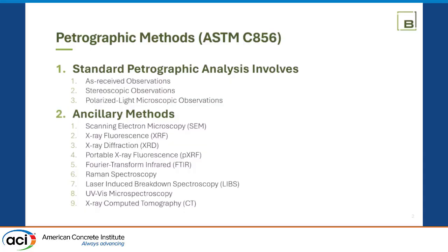Fourier Transform Infrared is another one I like to play with, especially attenuated total reflectance. That can be point analysis or bulk, depending on how you set it up, whether it's on a microscope or on the bench. Its twin sister is Raman spectroscopy, if you ask me, and Dr. Garg has given a nice presentation on the use of that. A lot of things you can see, they kind of overlap with one another in what they can see.